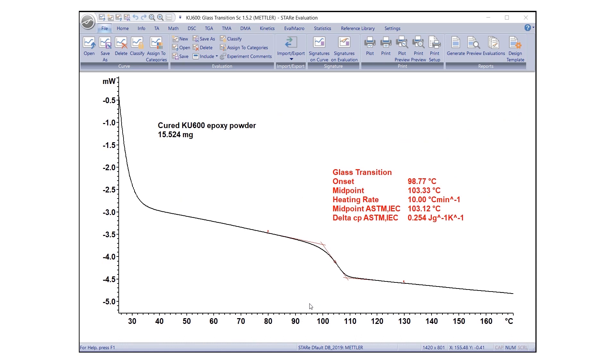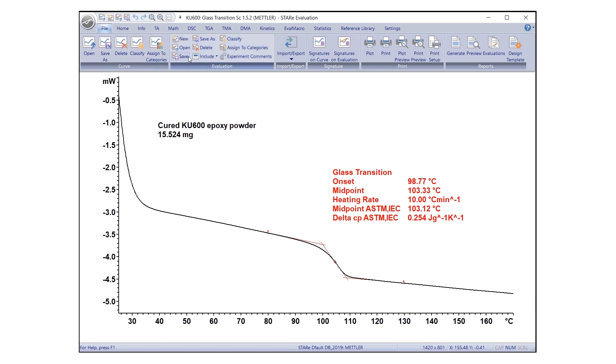It is often useful to compare results from different evaluations by displaying them side-by-side. Another useful feature in STAR-E software allows you to include existing curves in an open evaluation. The procedure for this is simple. Go to the File tab and click the Include icon in the Evaluation group. From the drop-down menu, you can select where you would like the existing evaluation to be included.